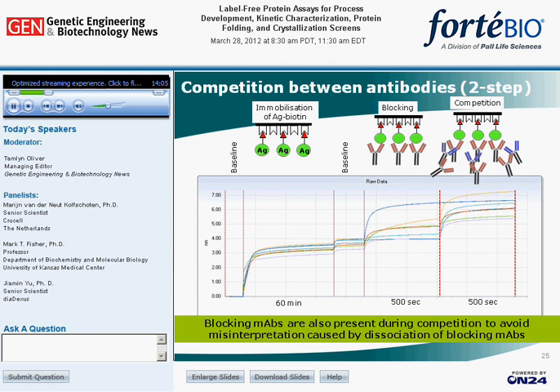In this approach, the antigen is first immobilized to the sensor, followed by binding of the blocking antibody, and next transfer of the sensor to a buffer containing the competing antibody in the presence of the blocking antibody, to test whether the antigen is blocked. Next slide.